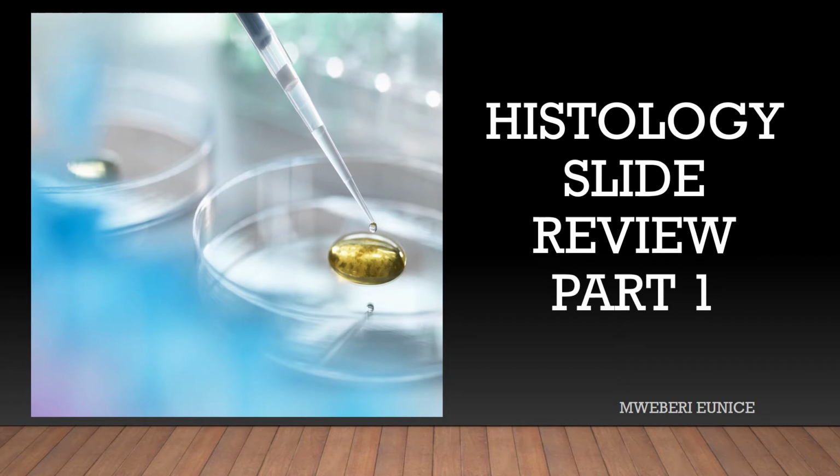In this series, we're going to be covering histology slide identification and most frequently asked questions in a marathon exam. So in this video, we'll be covering the cell, blood, connective tissue, cartilage, bone, nervous system, lymphatic system, and cardiovascular system.